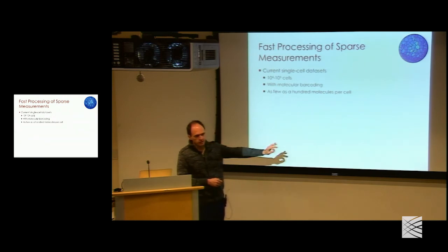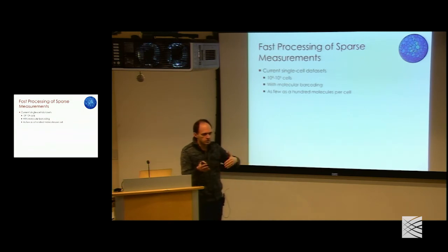And so you generate the cDNA with that, and then you make sure that in your further processing in second strand generation and amplification and so on, you basically maintain that region. That means that all the products that will be generated from that initial molecule will carry that 6 nucleotides, this unique molecular identifier, with them. If you amplify that particular molecule 20 times, you can look up the unique molecular barcode and see, okay, it's the same gene, same cell, and it has the same molecular barcode. So most likely all these reads came from this one molecule, and I shouldn't count it more than once. That's the logic.